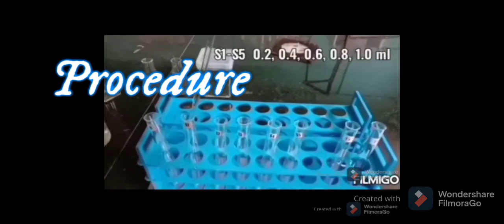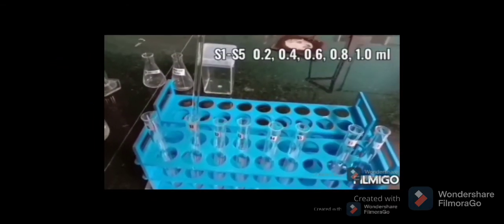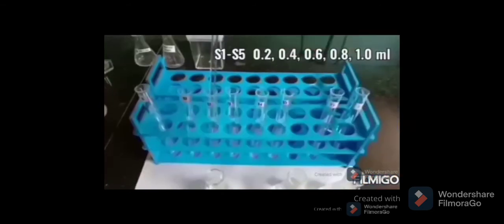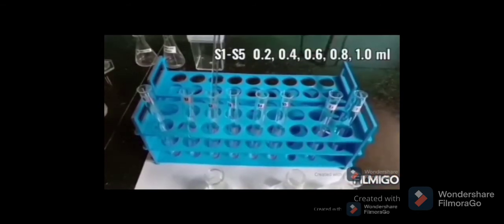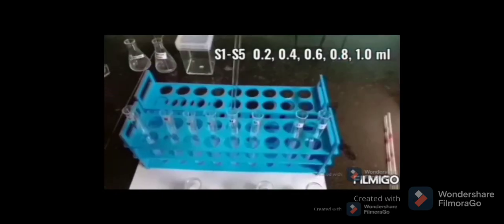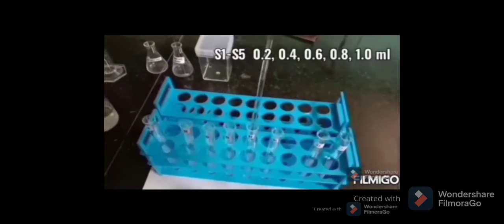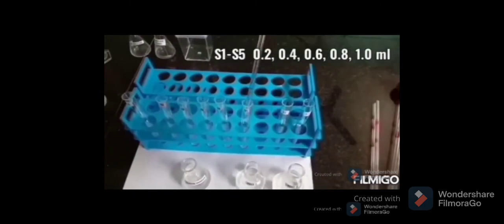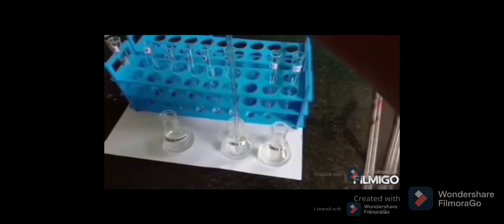The procedure starts with the addition of working standard of 0.25 milligram per ml concentration to standard tubes marked S1 to S5. Add exactly 0.2, 0.4, 0.6, 0.8, and 1.0 ml of working standard to tubes marked S1, S2, S3, S4, and S5. Accuracy of addition is very important in quantitative analysis for getting accurate results.